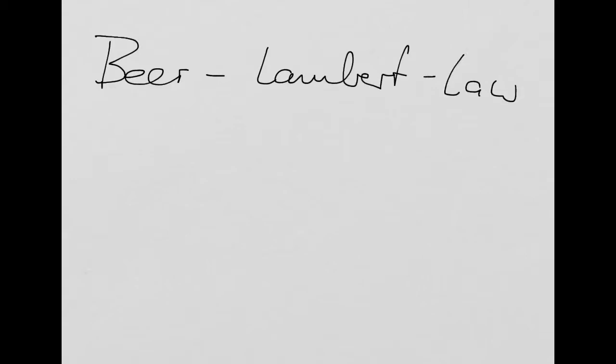Beer-Lambert law. We sort of derived what it's all about. It basically allows you to do calculations, and this law really is about the absorption in a spectrophotometer that you can easily measure.